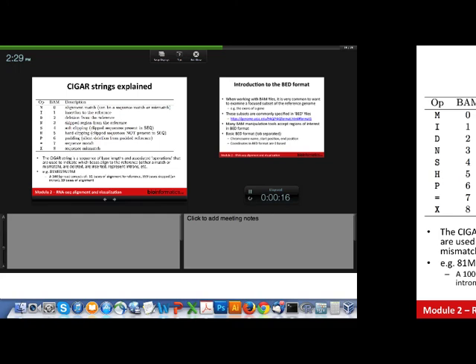The colors in IGV can indicate different things depending on the options — you can right-click on a track and select 'color by' with many options. Right now they're colored by strand, since this is stranded data — all reads for this transcript are on one strand, with some reads for unannotated transcripts on the other strand. IGV is not the only viewer like this — there are quite a few competitors including Savant, which is similar and performs comparably. We're just going to review IGV in this course.